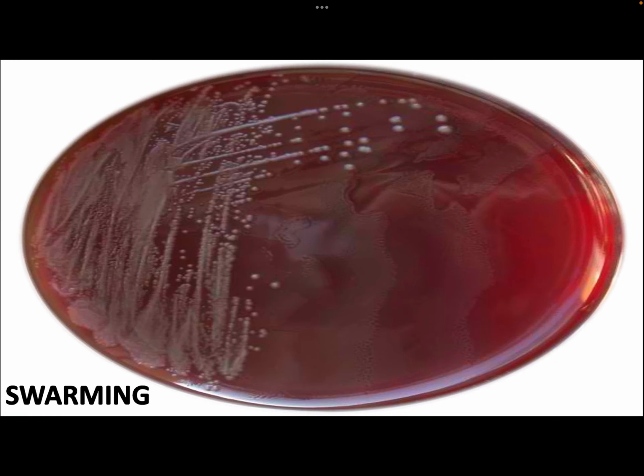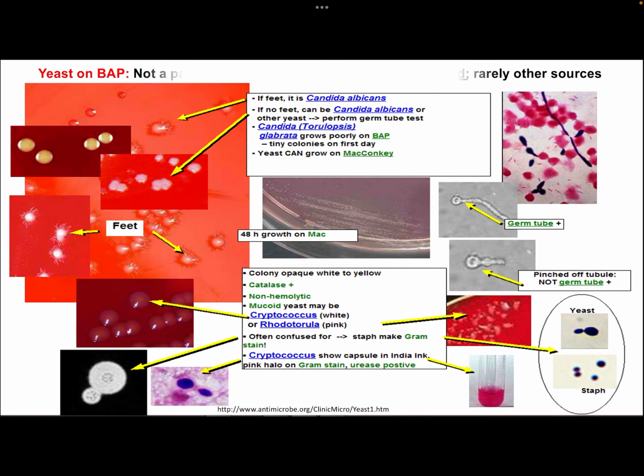Another thing you can commonly observe. You have there the colonies, but again, there is swarming. Just like this one. So that's how you work up. You're not just looking entirely at one colonial morphology, but you also have to take a look at the gram staining reaction.